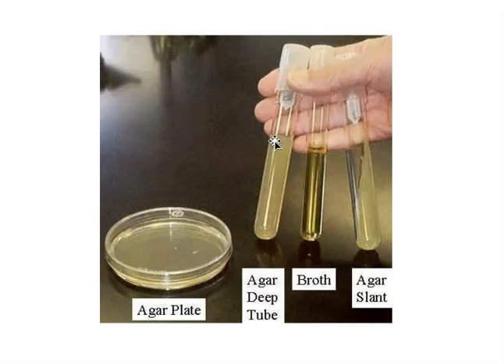We take the wire, we put some bacterial cells on it, and then we stab the wire down into the agar. What that's going to do is allow organisms to grow deep in the agar that might have trouble growing in the presence of oxygen. Some oxygen can actually penetrate agar, but it can only penetrate a short depth.